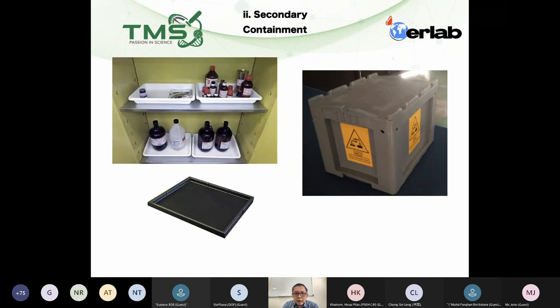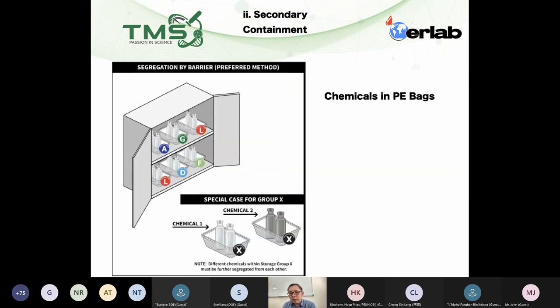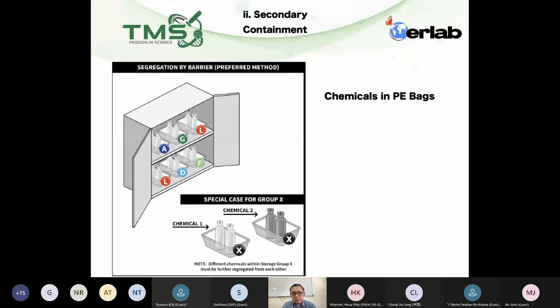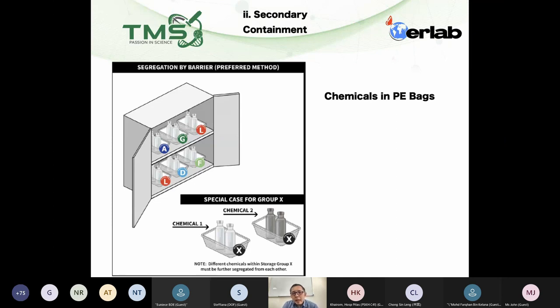This is an example of how to segregate using secondary containment arranged correctly. For very toxic or very corrosive chemicals, I also recommend placing them in PE bags as an additional layer of secondary containment — you essentially cover the entire bottle with a PE bag.